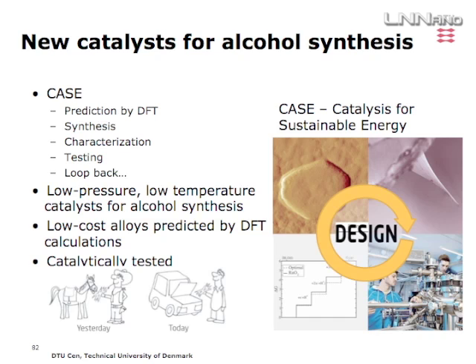In this case, it's from the alcohol process, where we're trying to synthesize alcohols: methanol and ethanol. So basically, yesterday you were feeding your horse with hay. Now we want to put the hay into the car, but we probably have to do some pre-treatment first.